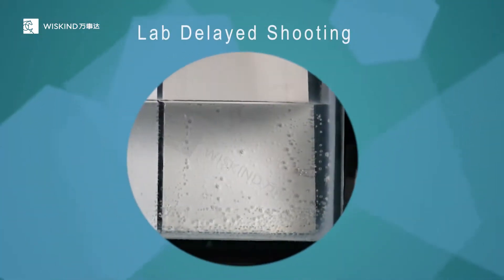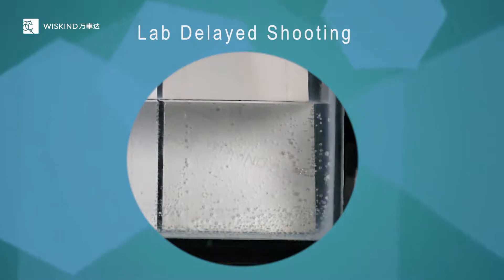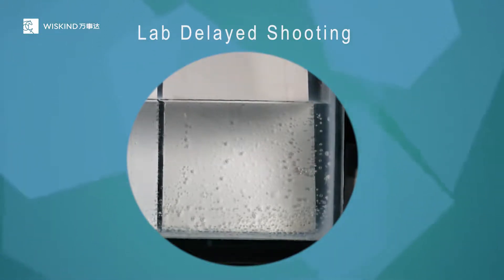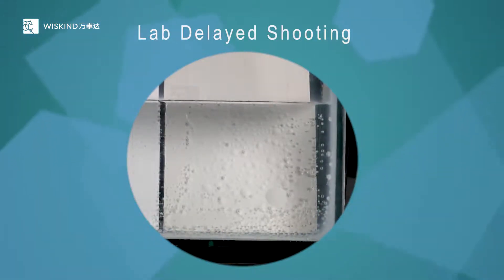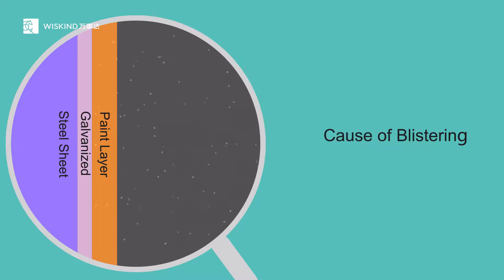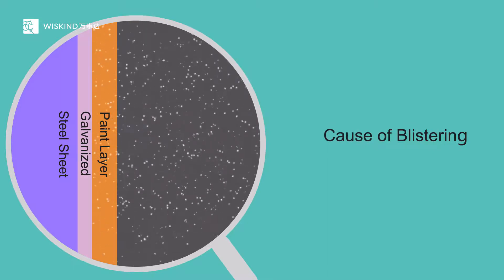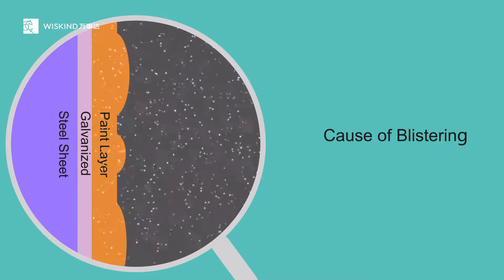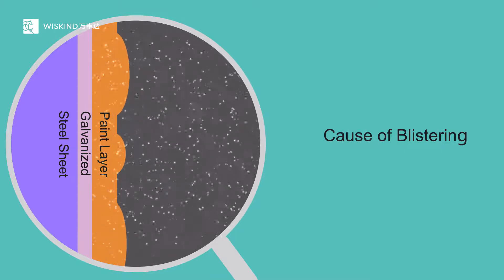Although VHP is highly effective in sterilization and has no residue, high concentrations of H₂O₂ will cause corrosion on color steel sheets. H₂O₂ itself is a strong oxidant and causes the surface of color steel sheets to blister, as H₂O₂ penetrates into the paint coating, decomposes into water and oxygen, and arches the coating under temperature changes.